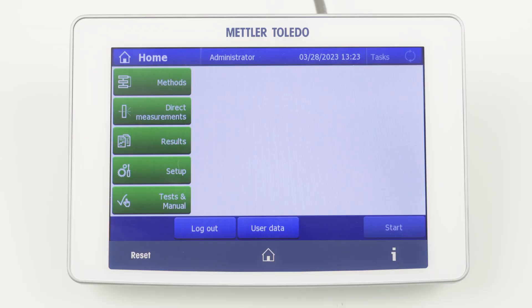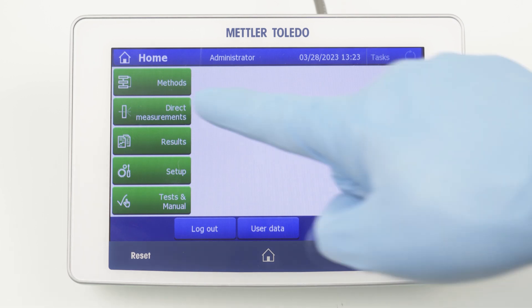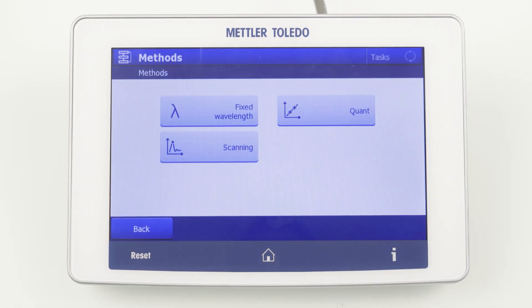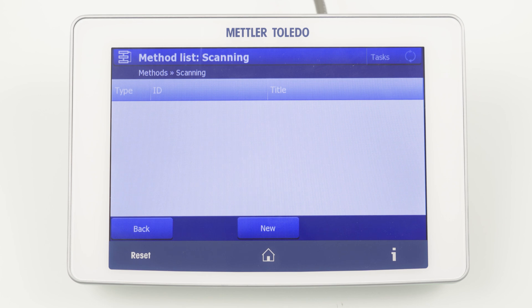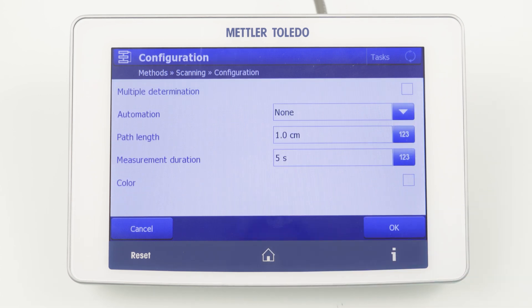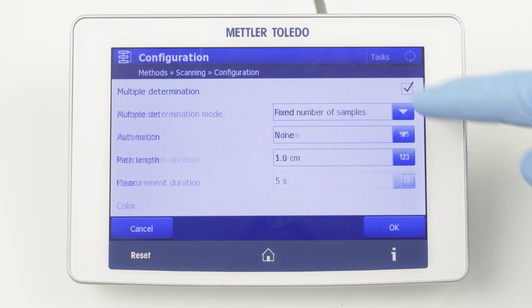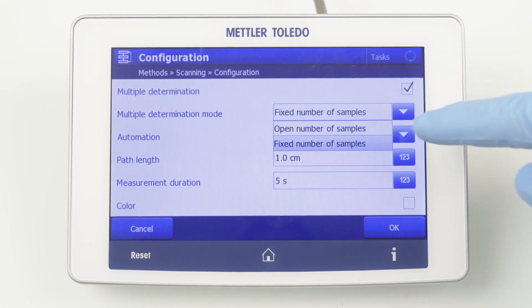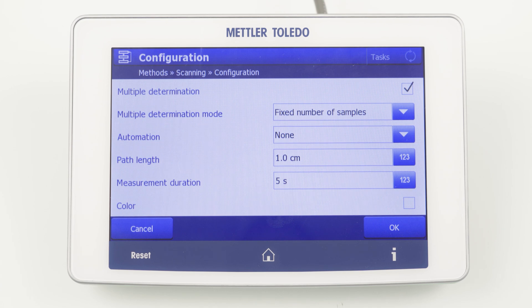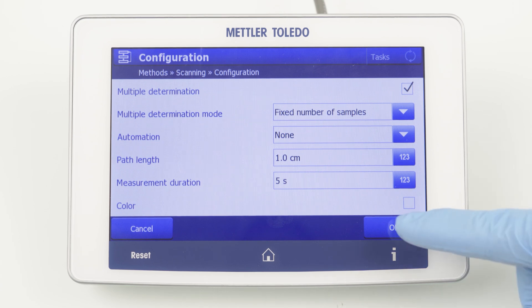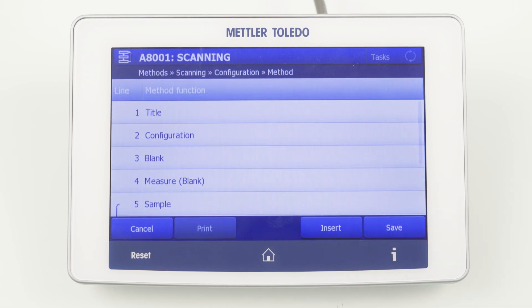Let's start with the method configuration. To create a new method, click Methods and select Scanning. By clicking New, the method configuration is started. If we want to measure multiple samples, we can activate multiple determinations and define whether we want to measure a closed or open sample set. Now we can see the method editor.